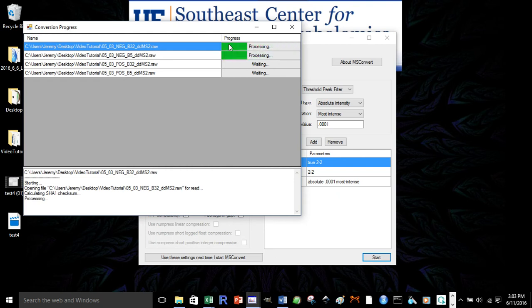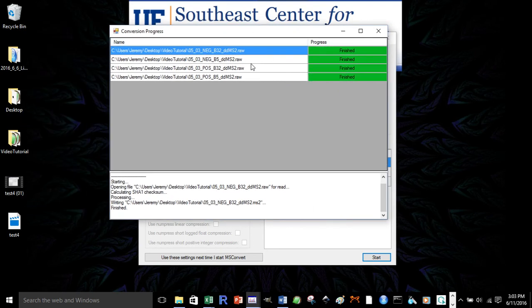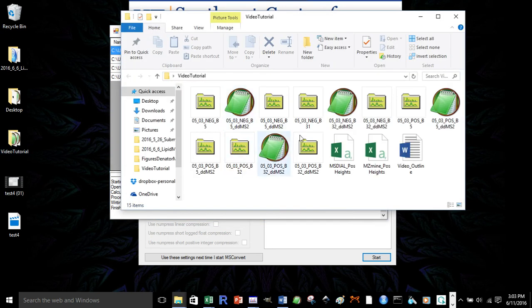Now, while it's progressing, it will either say that it was completed, finished, or it will have failed. If it has failed, just rerun that sample in which it failed for, and it should work. Once it's finished outputting, your files will appear in the same directory, in this case where you uploaded them. And the icons might look different.